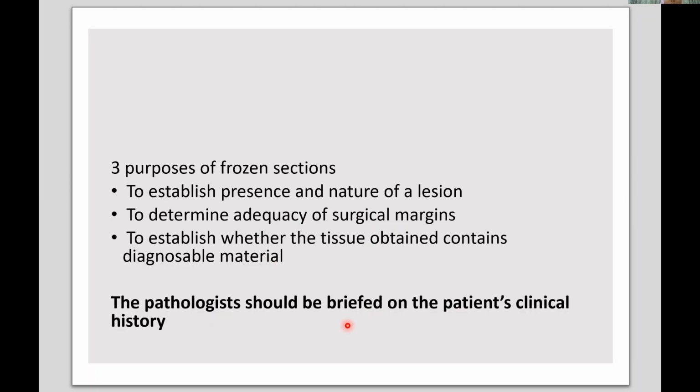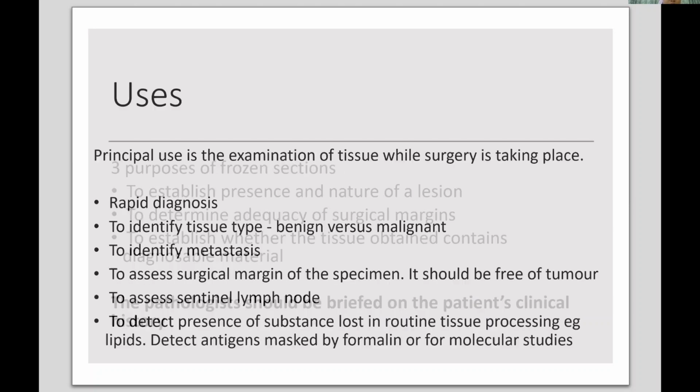That's why in our hospital we ask you to at least make an appointment for frozen section 2 or 3 days before the day. Yes, so we need to know the clinical history, so we need to prepare first, then we can proceed with the frozen sections.